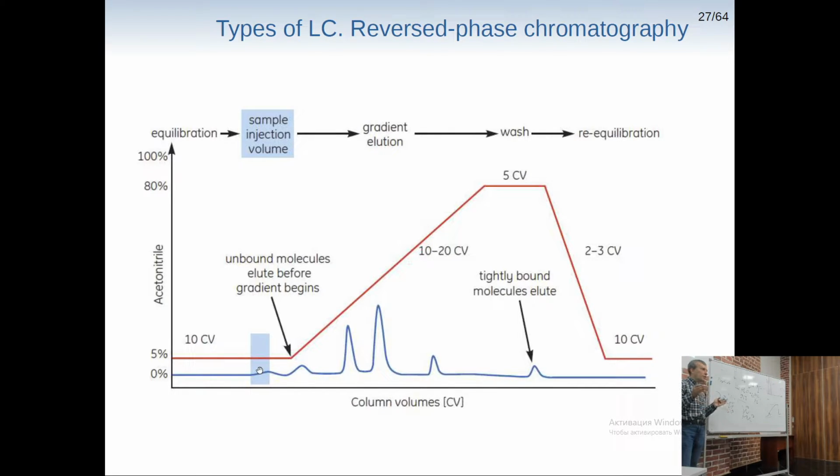Because they can hamper our analysis. With this chromatography, we can add our peptides on a column and have some minutes of elution where no peptides elute at all and everything goes into waste, not into our mass spectrometer contaminating it with salts. And then, when all salts are already gone, we can switch to the mass spectrometer. So, as you can see, we can even desalt our sample on the column for our mass spectrometry equipment.